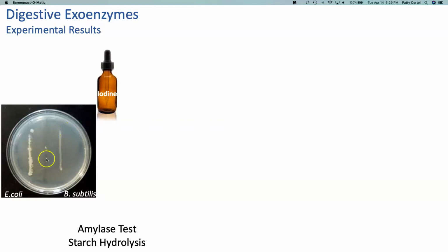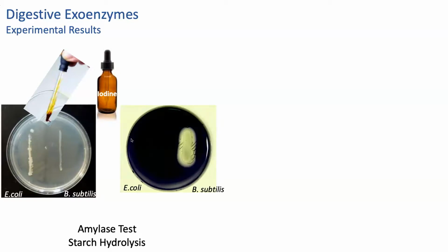If it breaks down the starch, then I add my iodine, which is the next step. I would flood my plate with iodine. The iodine, remember, is only going to bind to areas where starch is present, thereby giving me a sort of purplish dark color. Whoa, this looks almost black here, but if you look at the outline at the bottom, it looks purple, right? Okay. So notice that where my E. coli streak was, I can't even see the E.